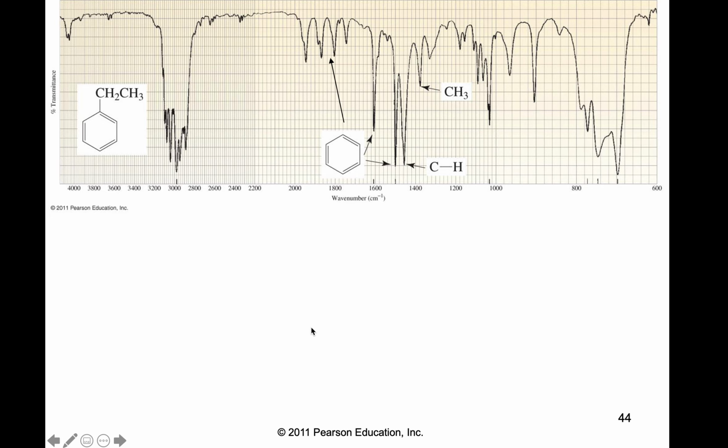This is an aromatic compound, and that's studied in McMurry in the second semester of organic, and that would be ethylbenzene. The benzene being that 6-membered ring, an aromatic it's called that, and you see why later in the course. There's conjugation here of the 3 double bonds. This is called an arene, A-R-E-N-E. Arenes are benzene rings with alkyl groups on them. Very important. And boy, oh boy, look at the absorption bands.